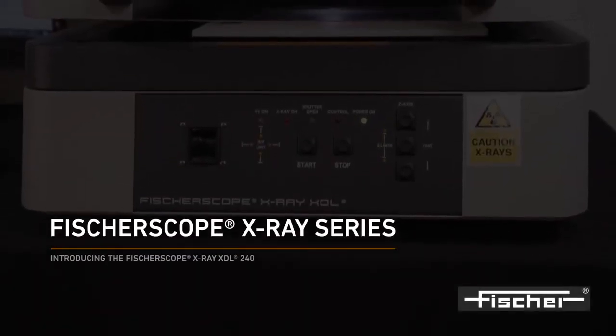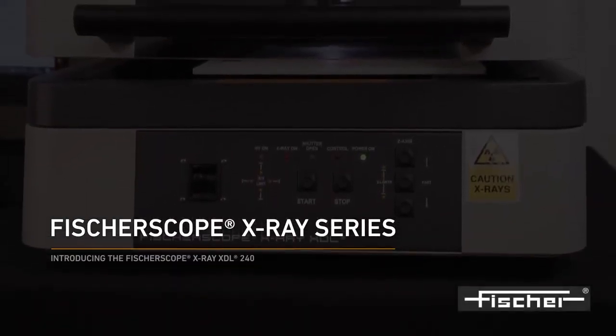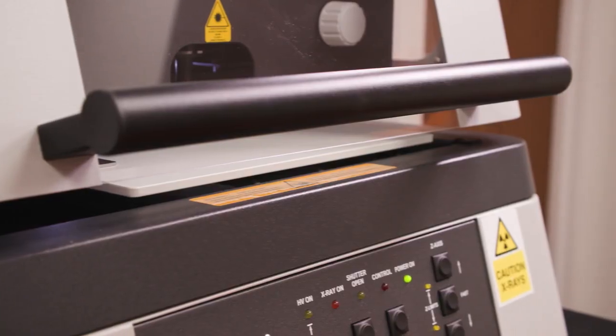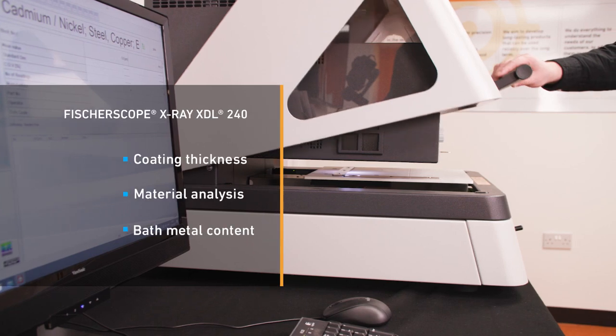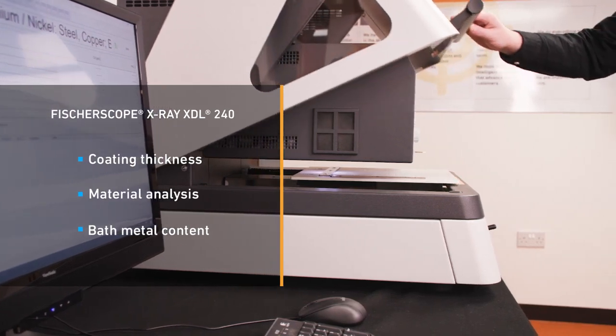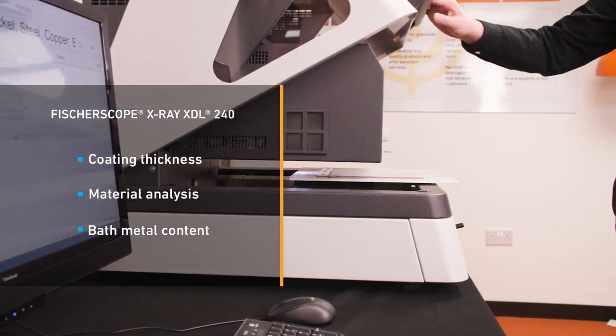Introducing the FischerScope X-Ray XDL-240. The FischerScope X-Ray XDL-240 is a robust, universal instrument for the quality control of electroplated components and plating solution analysis.